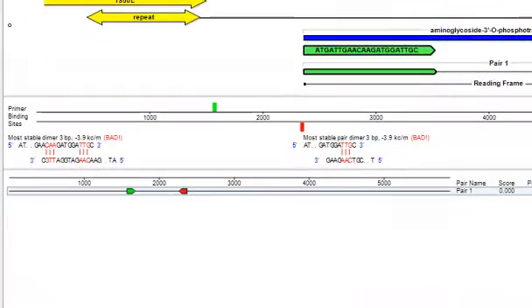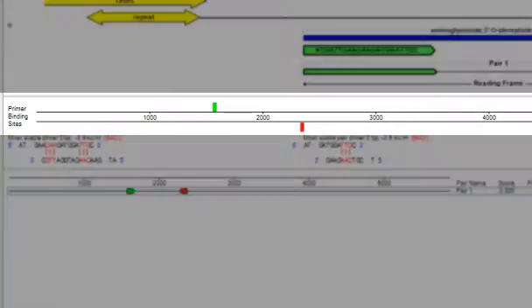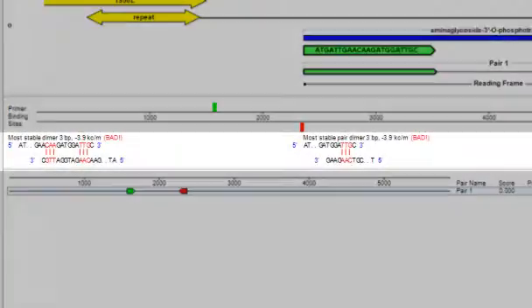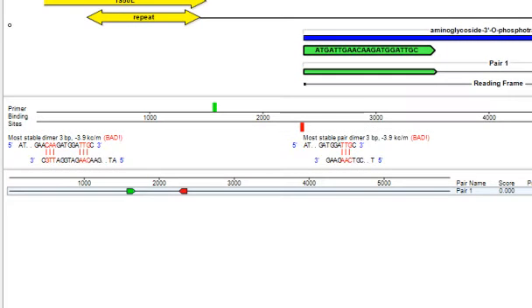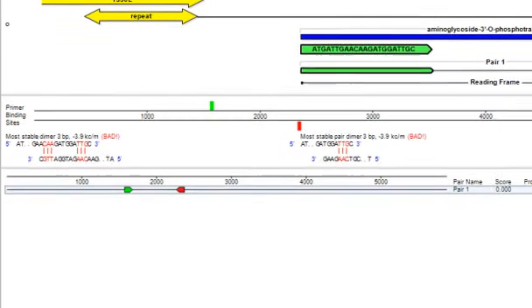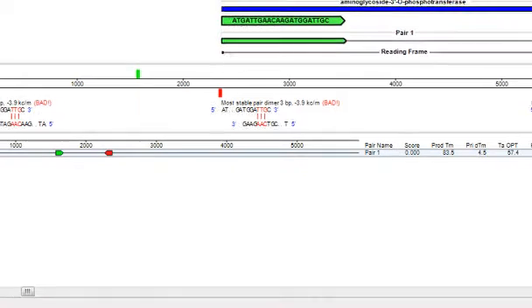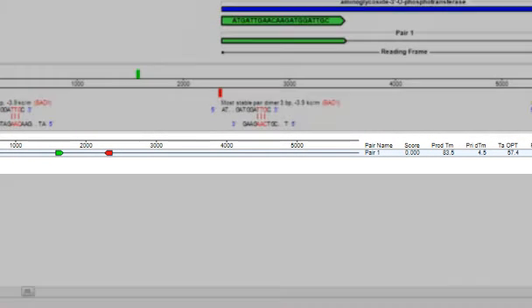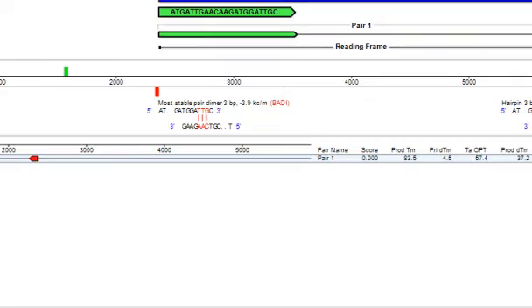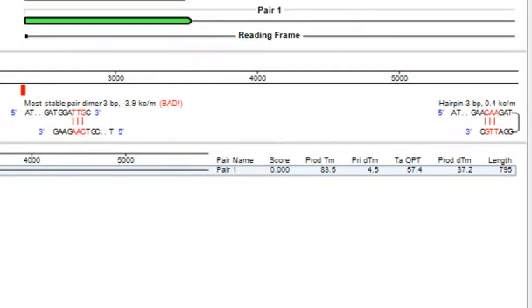The middle pane shows primer binding sites, as well as the most stable confirmation of dimers, pair dimers, and hairpins. The bottom pane displays the list of primer pairs discovered by your search. And in this case, I just searched for one pair, although I could have adjusted the parameters to find more.